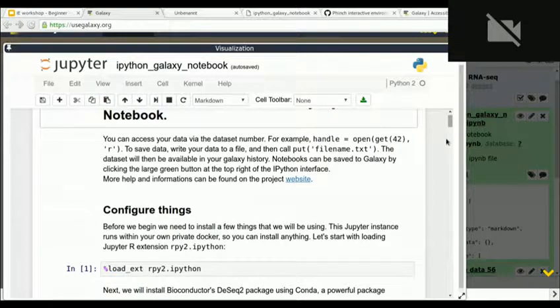When you have like /dev something, where you install it, and not on /var/lib/docker. Yeah, because it will fill up, right? Yes. The way to do this is to symlink from /var/lib/docker to the place that you prefer for it. And then you can choose a layered file system which matches your system.